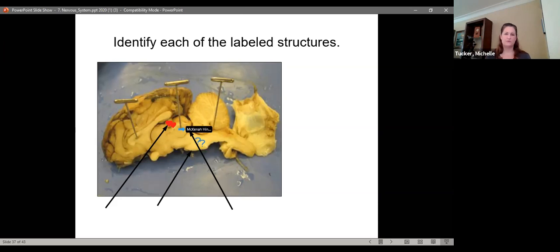So it kind of goes, yeah. And then just below that is the inferior colliculus. So the superior colliculus is this part here, and the inferior is this part here. This is not ideal because this got torn here, so it looks a little odd.